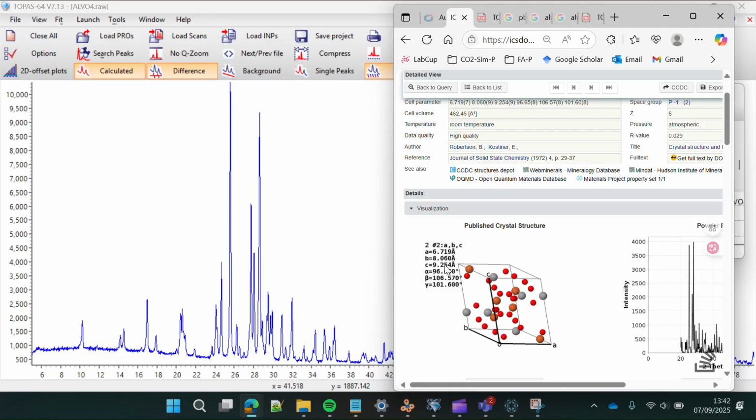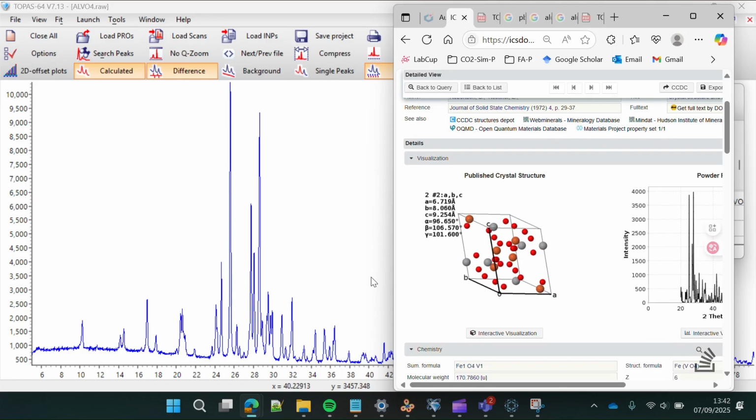So now we're going to run a Pawley extraction. We're going to extract an A matrix file. However, you can also extract the HKL intensities. I just like doing A matrix files because it works for charge flipping. And so we're going to go set up our Pawley input file, and I'll be back in a second.